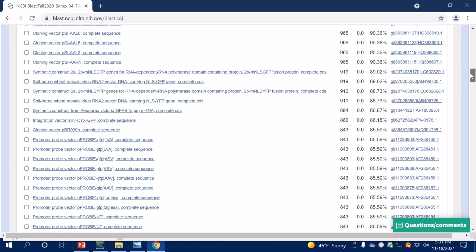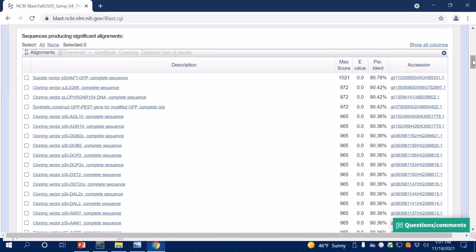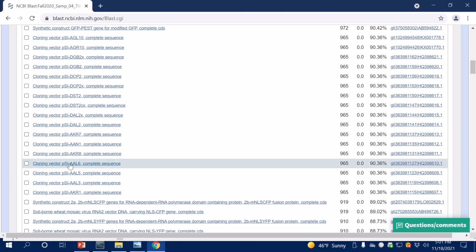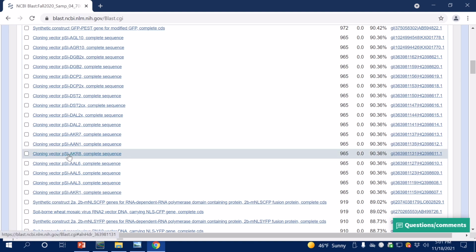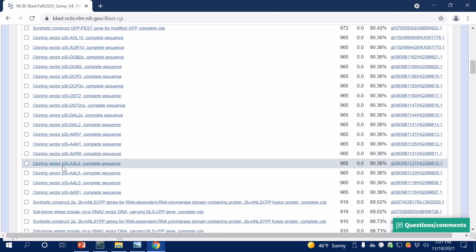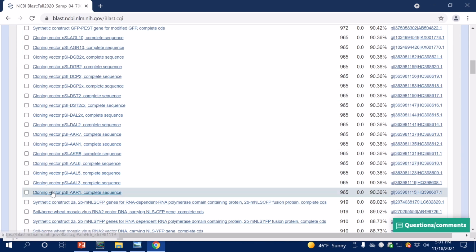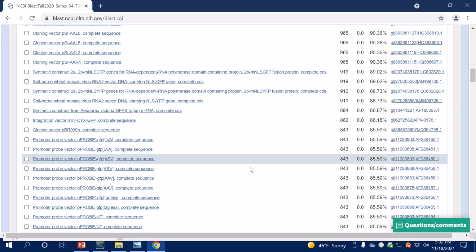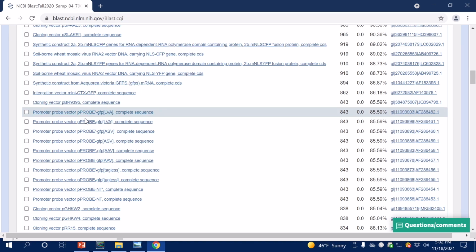One thing to point out, though, is that plasmids are typically, or almost always, named by putting a lowercase p at the beginning of the name, and then some letters or numbers to denote what the plasmid actually is. But you are looking for a specific gene rather than a plasmid itself. So the gene is in some of these names, but more than likely, if you have something that's repetitive, like what's seen right here, this whole list of things where just a single letter or number changes, that's just describing the plasmid and not necessarily the gene that's in the plasmid. So try to look for other ones and see what you can actually find.